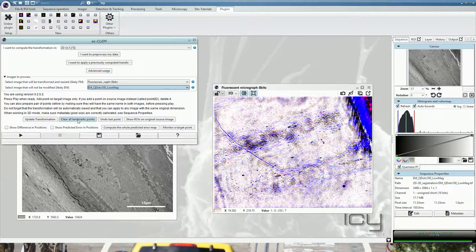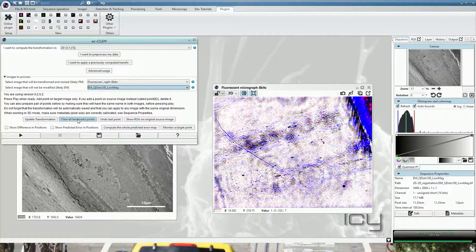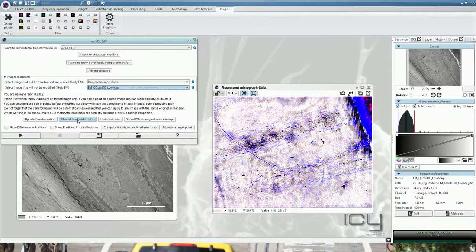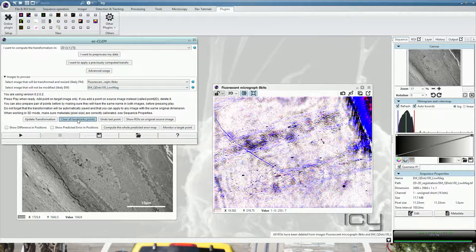Then you can start by clearing all landmark points. Sometimes by doing your fluorescence analysis or electron microscopy analysis, you add landmarks and they will be disturbing for the registration. So you clear all landmark points and start the plugin.